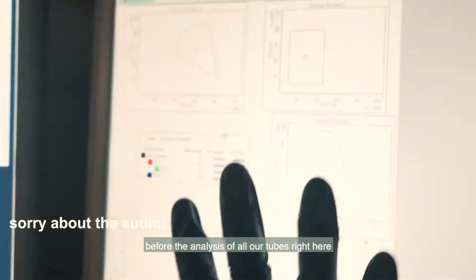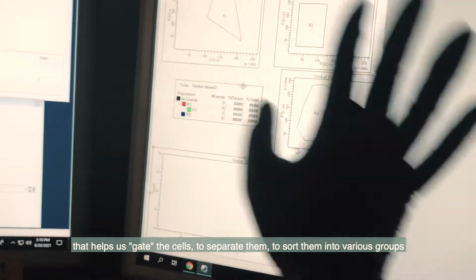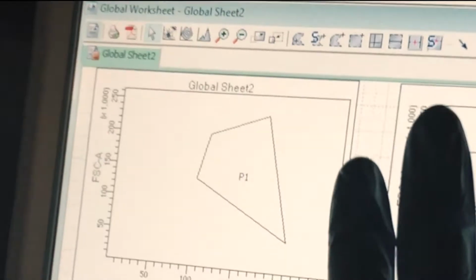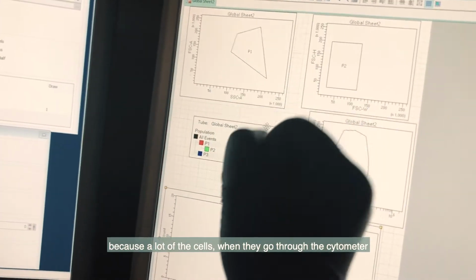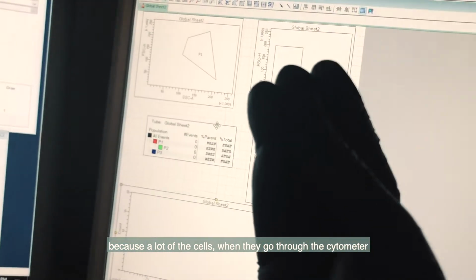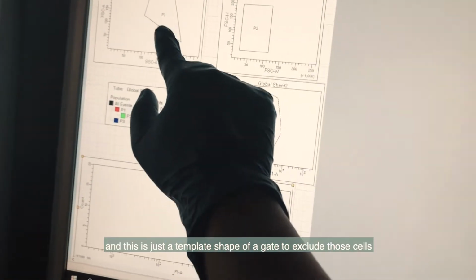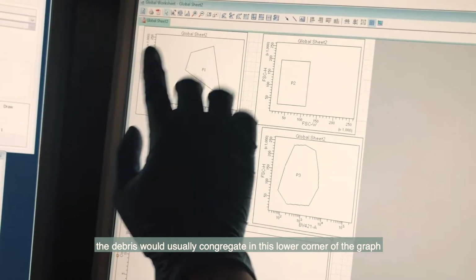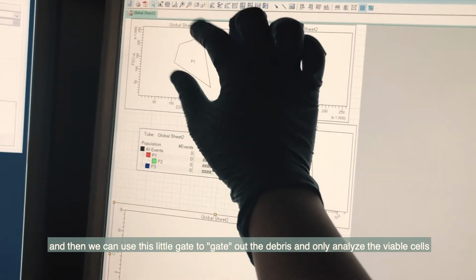So before the analysis of all our tubes right here, we have to set up a global worksheet that helps us get all the cells, to separate them, to sort them into various groups that they belong to based on the markers that we're testing. So the first one is the most basic, ruling out cell debris, because a lot of the cells, when we go through the cytometer, if they're incomplete, i.e. they're breaking down and dying, they tend to be much smaller. And this is just a tentative shape. But usually they will congregate at the lower corner of the graph, and then we can use a little gate, a little shape, to gate out all those debris and only analyze the rest.